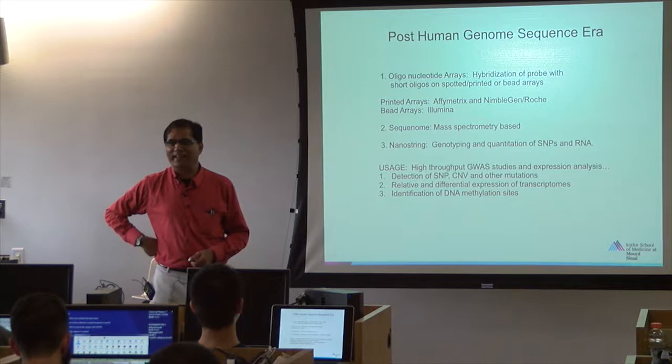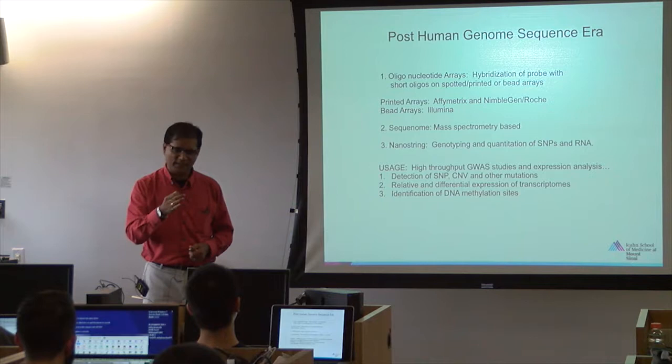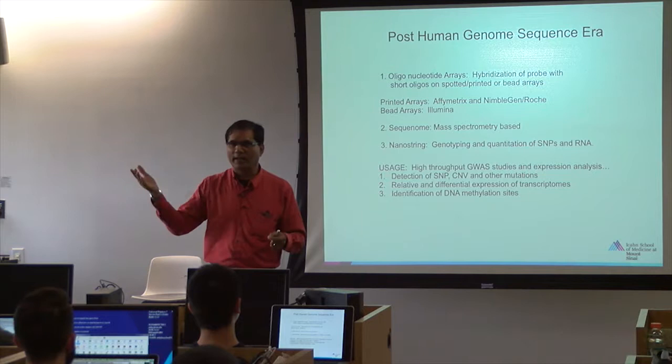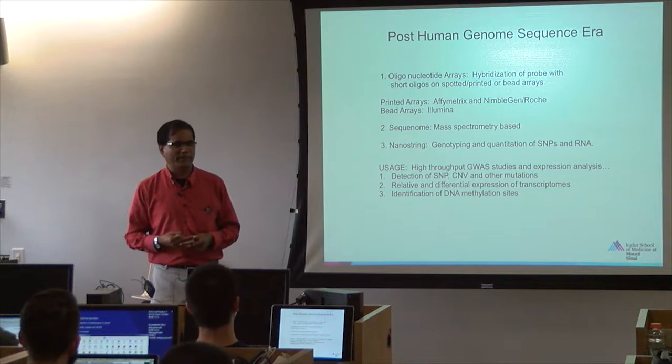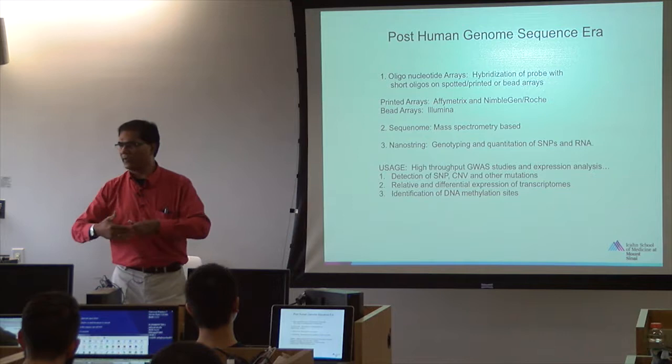And then photolithography technology was developed by NimbleGen, around 1999, 2000. Photolithography was like you synthesize the DNA on the slide itself, and it sticks to the slide tightly. Printing and synthesizing DNA go simultaneously together, and that revolutionized the microarray. People started making short fragments around 50 to 75 base pairs long. And then computerization came at that time. We can break the entire human genome into short fragments, automate that, and then start printing arrays.